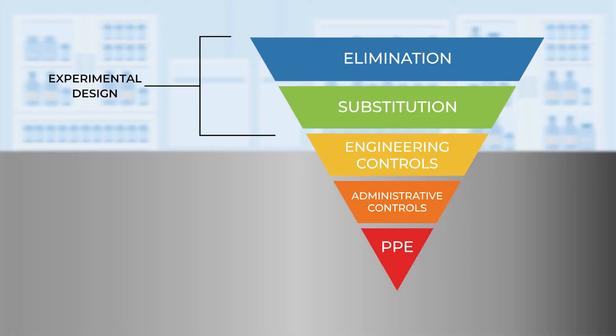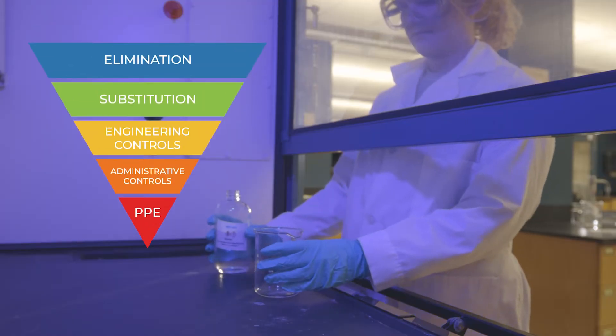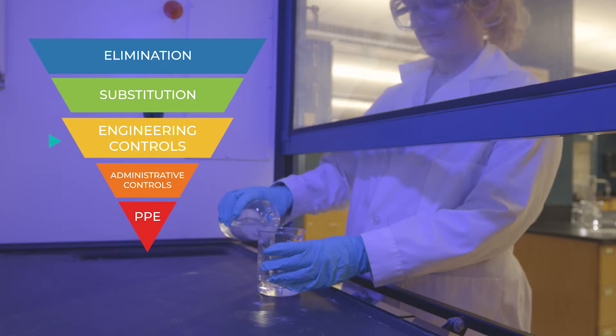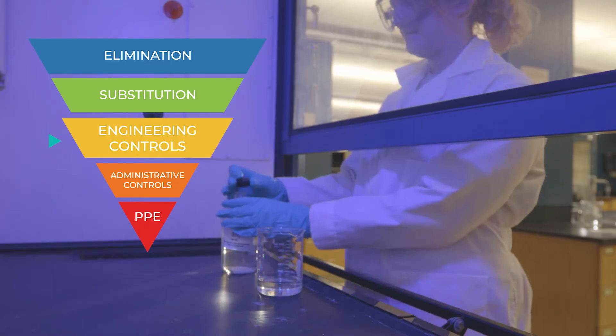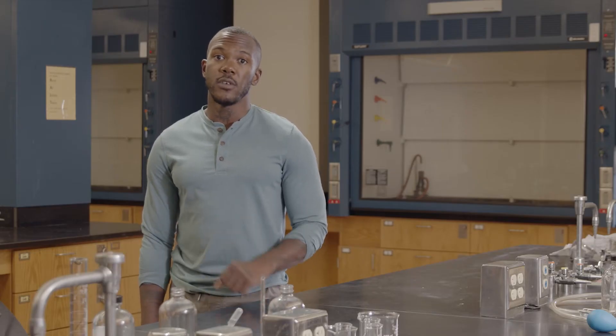Options 1 and 2 at the top of the pyramid have more to do with designing experiments, and your instructors have probably considered these already. So let's focus on the lower three options, which are steps you can take while in the lab to minimize exposure. Strategies that reduce the likelihood of exposure also reduce the risk. In the lab, engineering controls usually refers to using a fume hood. The main purpose of a hood is to remove gases and vapors, which lowers the chance of inhalation as well as fire or explosions.